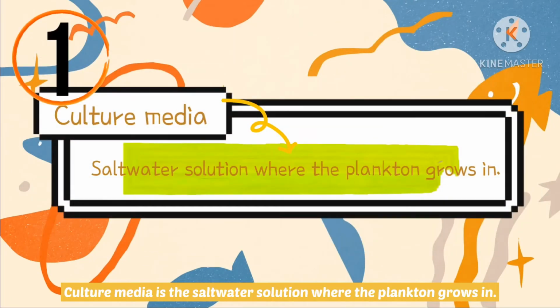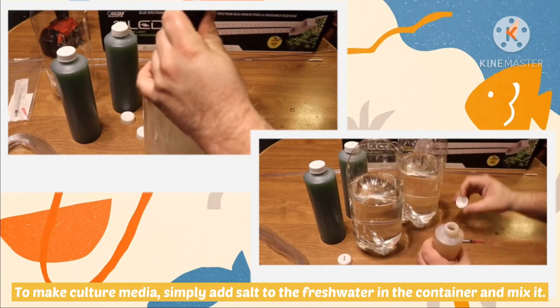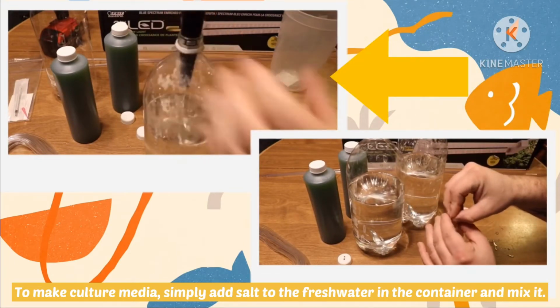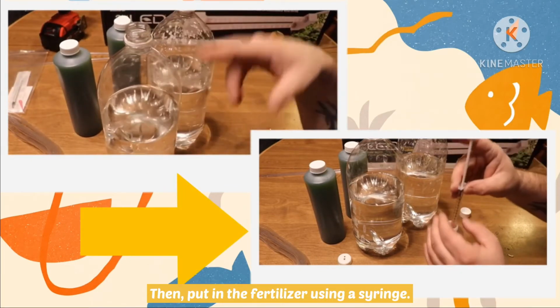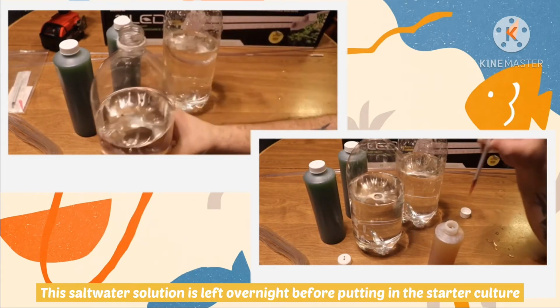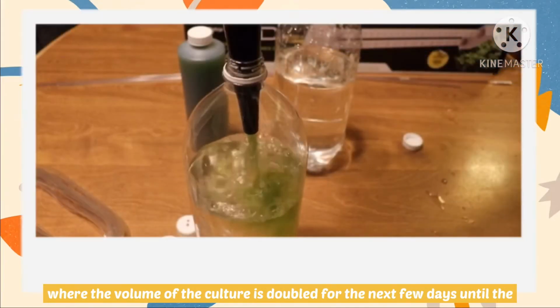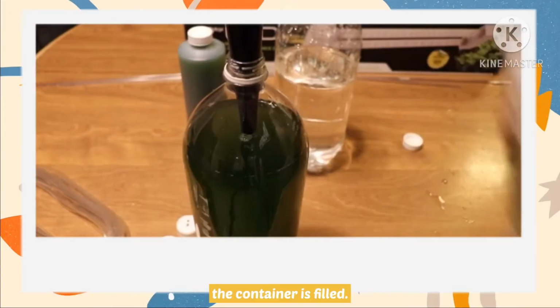Culture media is the saltwater solution where the plankton grows in. To make culture media, simply add salt to the fresh water in the container and mix it. Then, put in the fertilizer using a syringe. This saltwater solution is left overnight before putting in the starter culture, where the volume of the culture is doubled for the next few days until the container is filled.